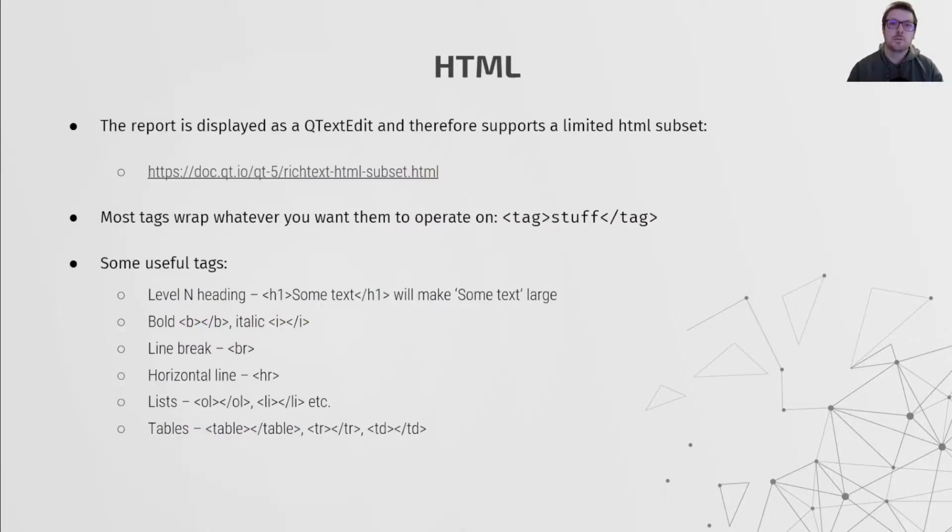Since our QAQC reports are essentially HTML documents, let's have a look at some basic HTML syntax. The report itself is displayed as a QTextEdit widget, and so supports a limited set of HTML tags. You can find the specific tags at the URL listed here.